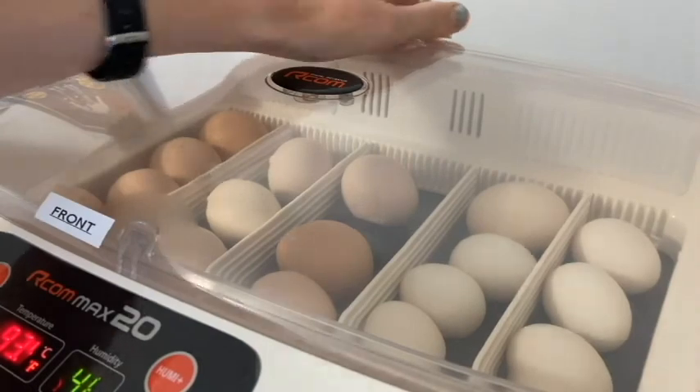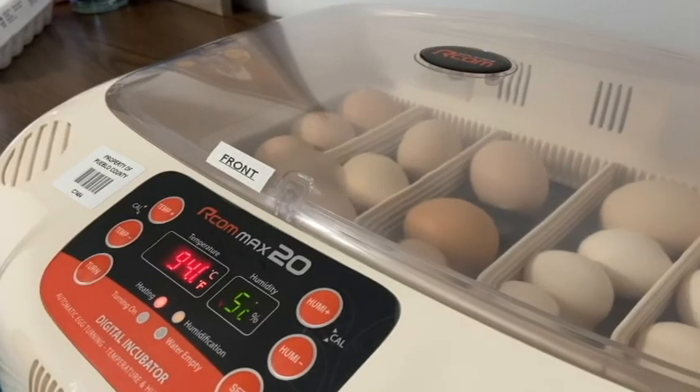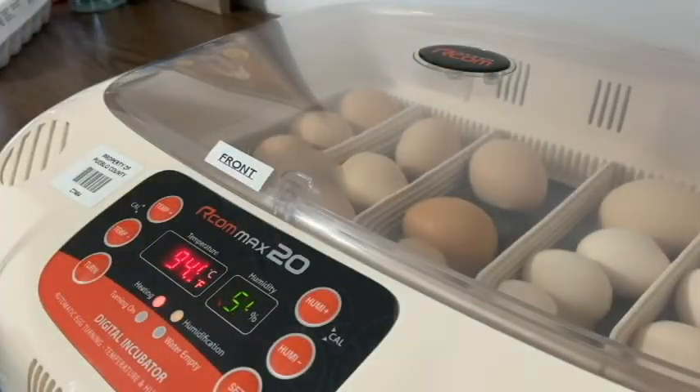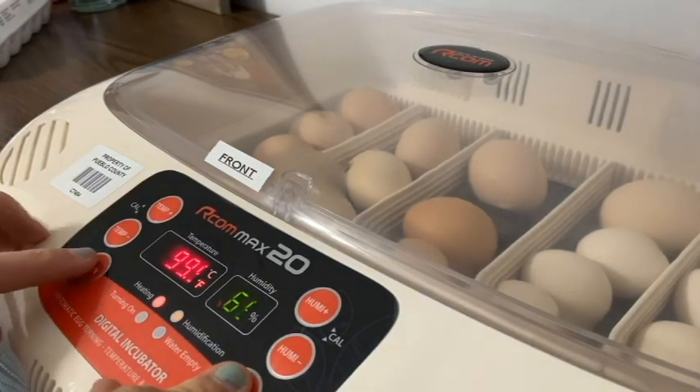And they are all into the incubator — 18 eggs, some Buff Orpingtons and some Millifleur Bantams. So the last thing we need to do is use our dial on the side to turn on our turning function. What that means is that this gray tray in the bottom moves every three hours, and of course that helps rotate the eggs, because an incubator is not a mother hen. If these eggs were on the farm, they would be turned by the mother hen. But because we don't have a mother hen, the incubator is going to do it for us.